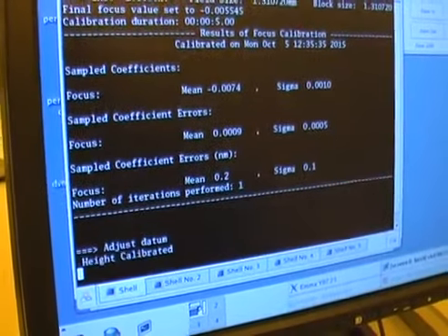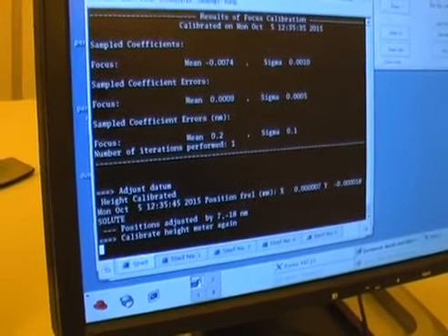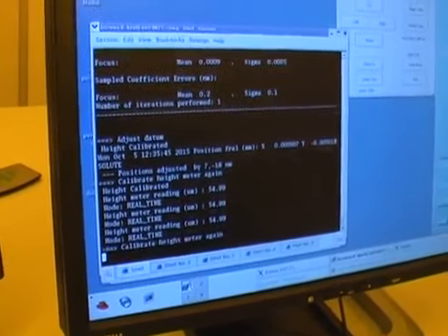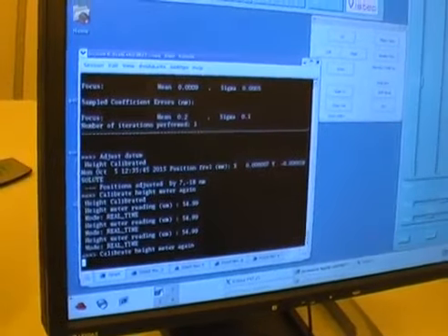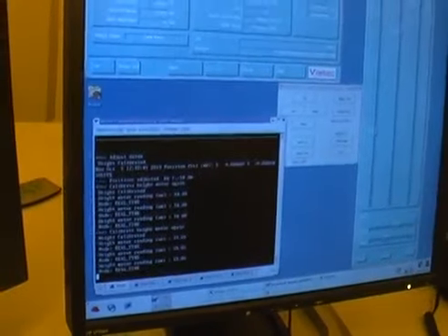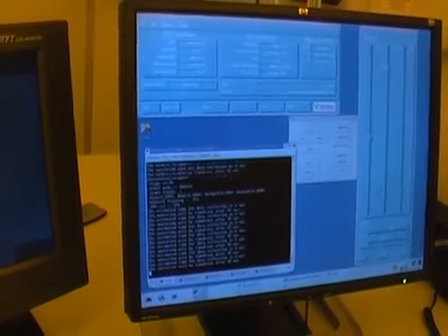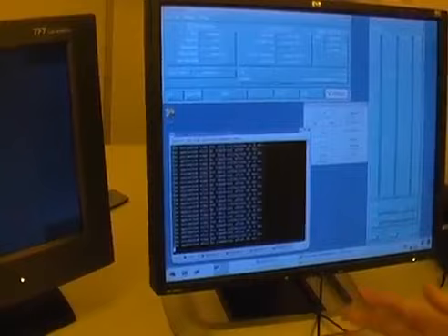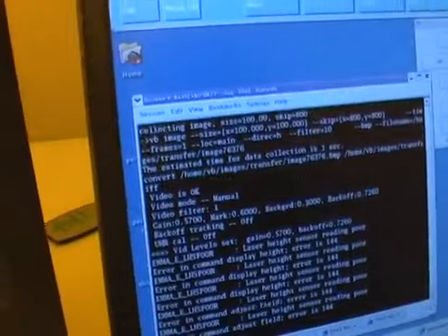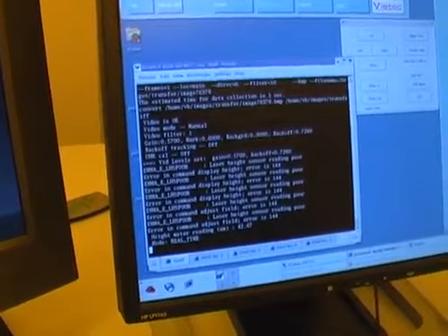It's going to run through a number of basic commands which are displayed on the screen here. And then it will move to the markers and try and find them. And this is where things typically can go wrong. And if it can't find the markers, we then need to adjust the marker search parameters, possibly contacting the user at the same time so that they are aware of the problem. At the moment it's doing the video adjust, and you see it's gone off the screen. You saw a nice top hat image which shows that there's a very clear looking marker.